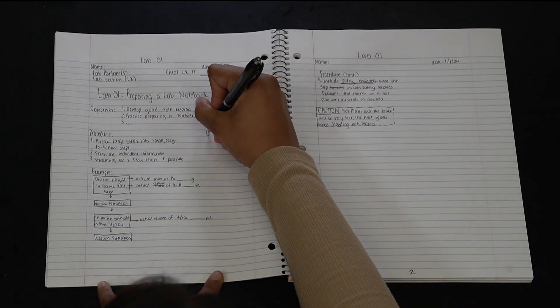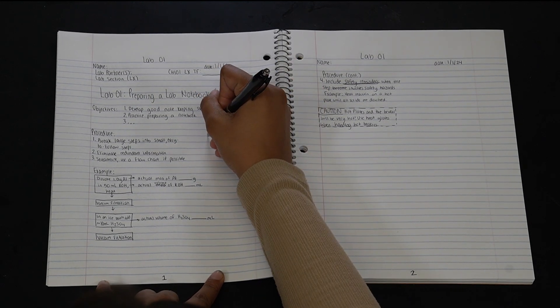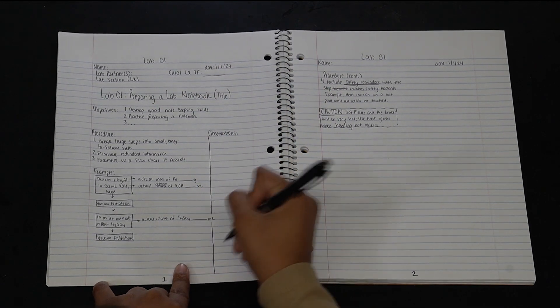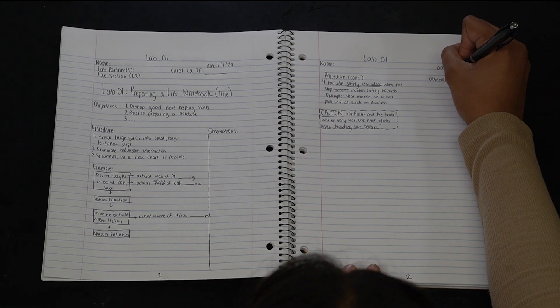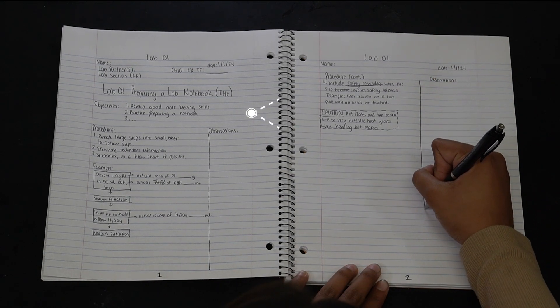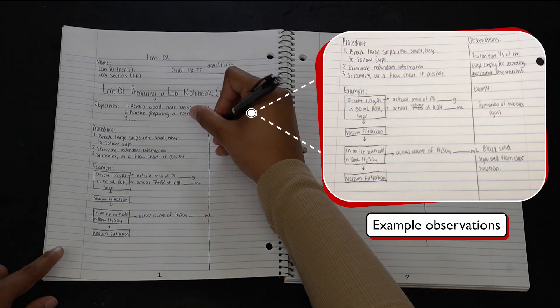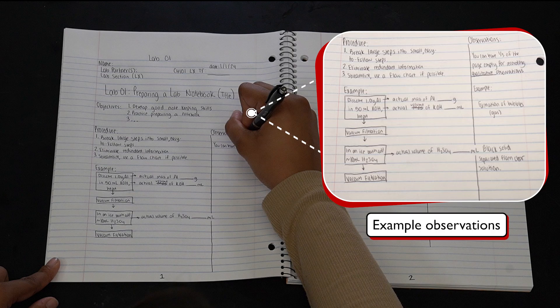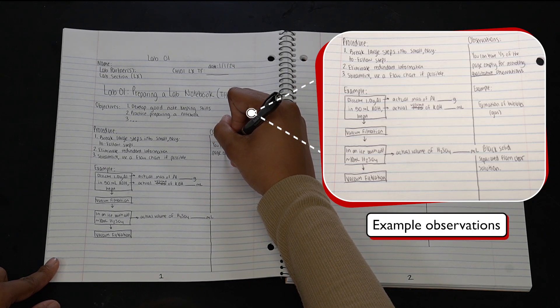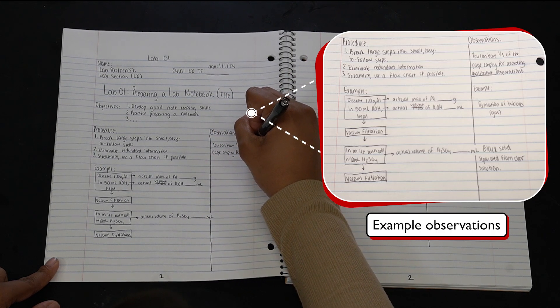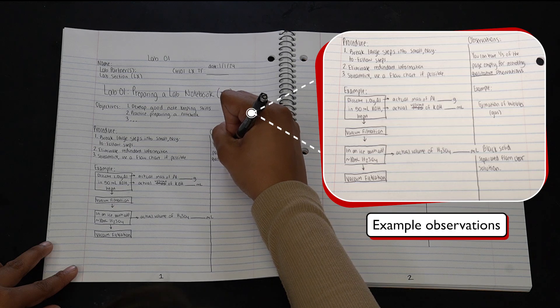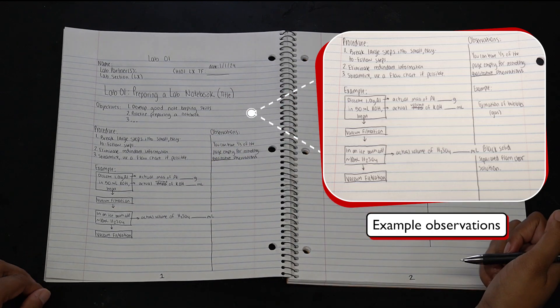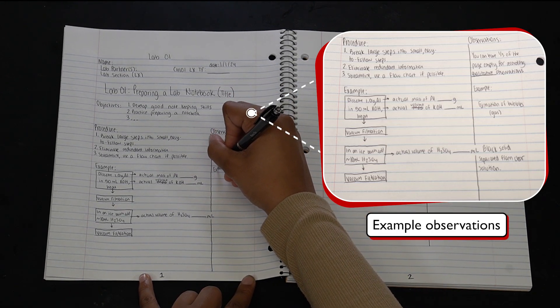After all, knowing that step 5 is dangerous doesn't help you at the end of the experiment. Second, we should reserve ample space for recording observations and measurements at each step. For observations, we can leave some empty space after each step, or alternatively design about one third of the page for observations, so as we are following along the procedure during the experiment, we can record the observations next to the step that it correlates to.